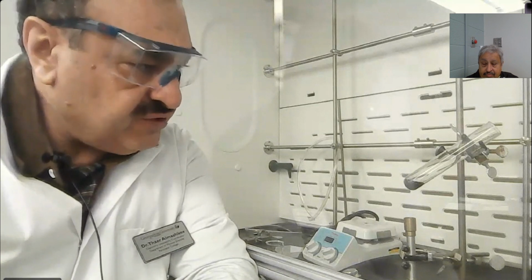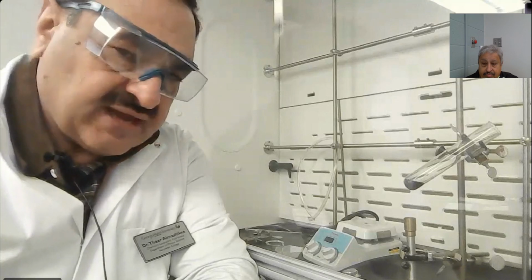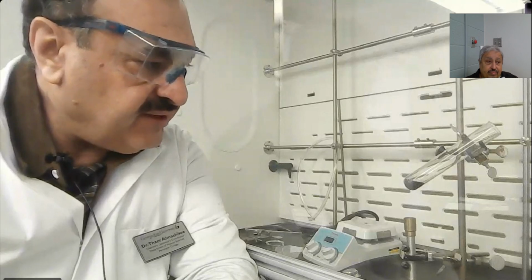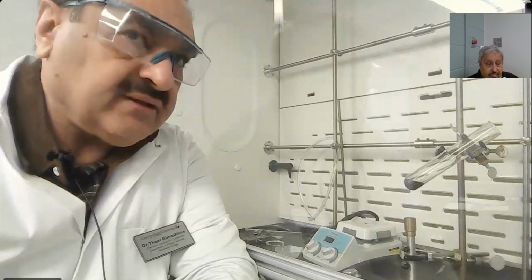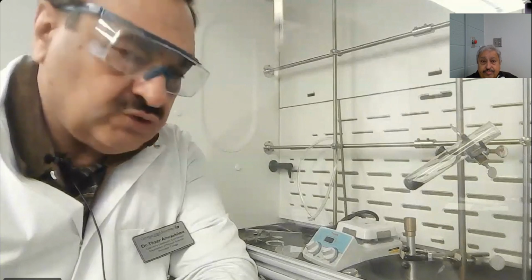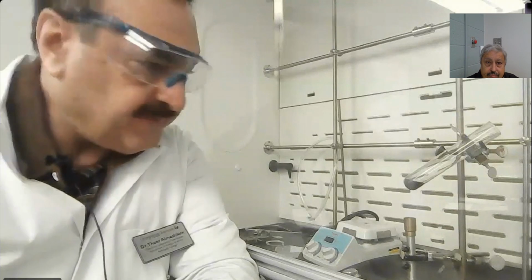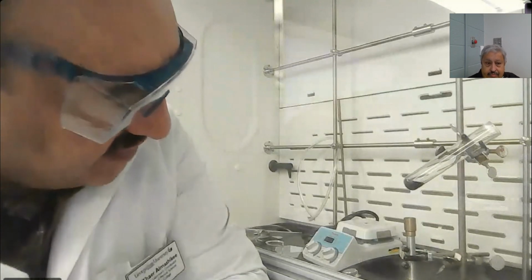When you finish, we need to clean your test tube by using tap water with a brush and dump any solution in the barrel that you put in the corner inside the room. You don't need to dump your solution inside the sink. Okay, this is for your safety and the safety of our environment.